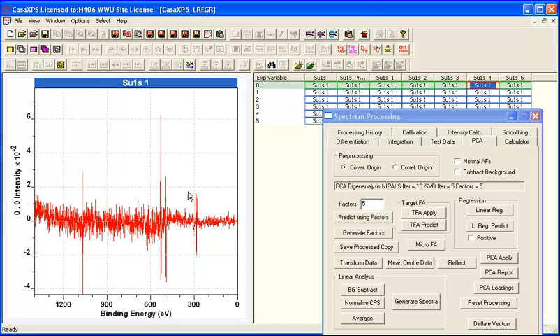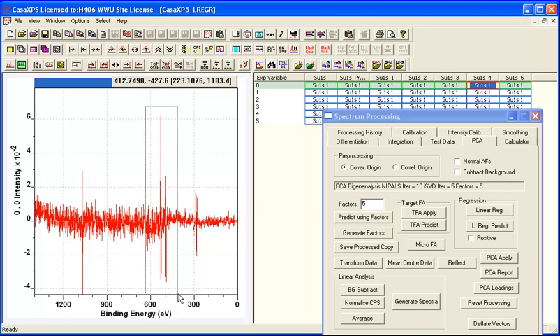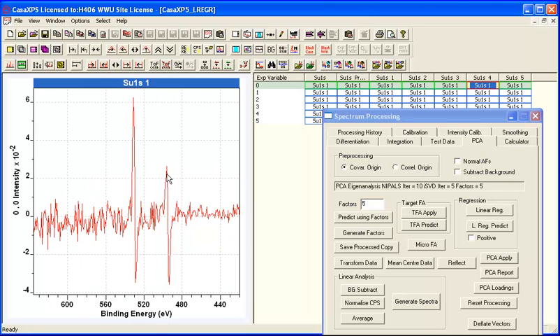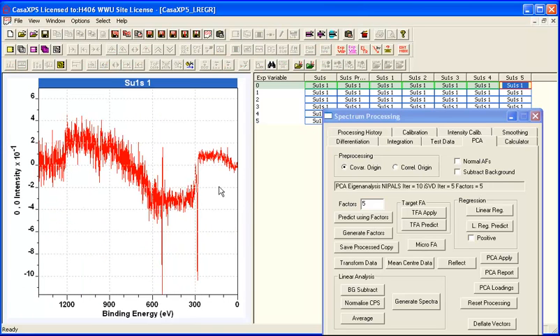These look like derivatives to peaks, so that may just be some sort of clear difference type shift, so that suggests maybe we're accommodating some charge shifting between these different spectra. And the last one, well, there's clearly some kind of shape structure here that indicates there's a little bit more going on mathematically than chemically.